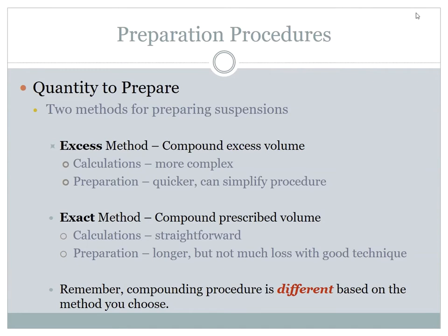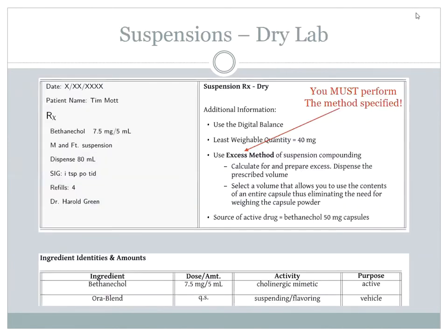You're responsible for both, and know that both the calculations and the procedure are different for the 2 different methods. So keep them clear. That's your assignment today as we go through this. Make sure you understand both of them. Okay? Let's start with the dry lab prescription, all right?